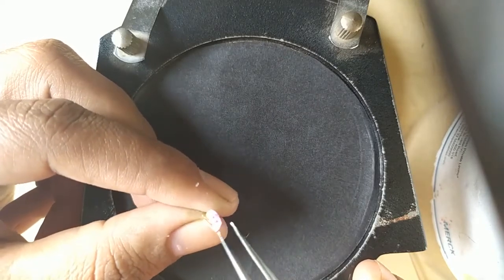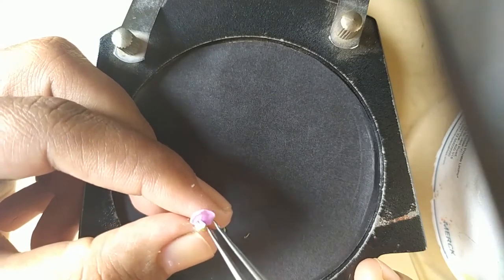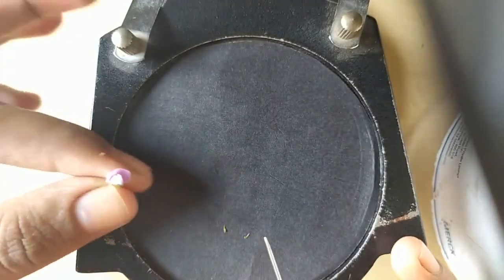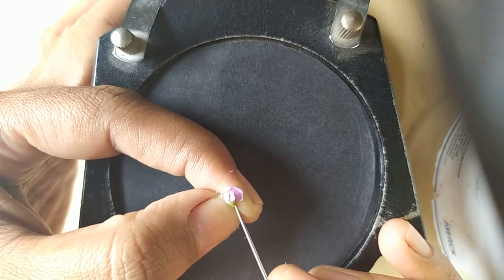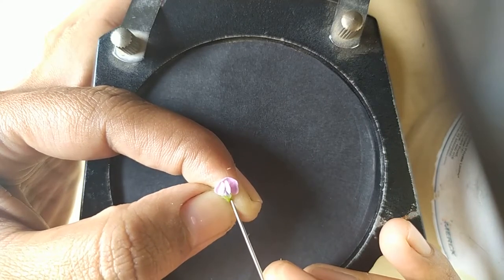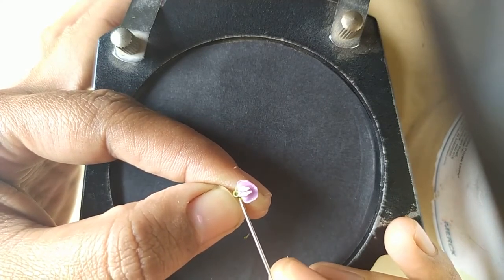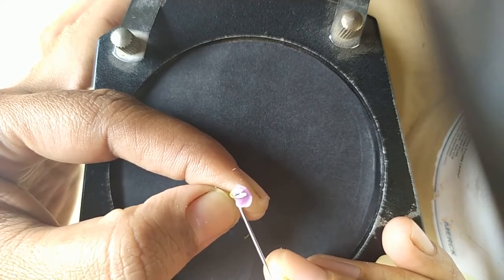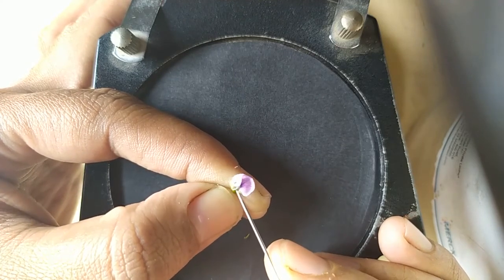Then the flower is too delicate, so do the dissection very carefully and gently. Give a vertical cut to the calyx, then slightly twist the flower and make the base free.